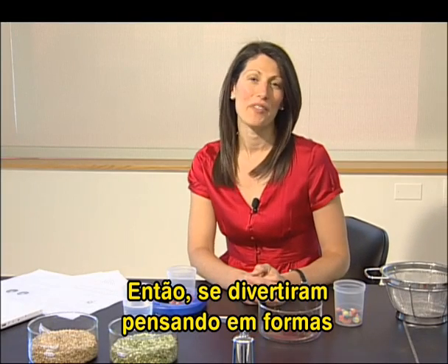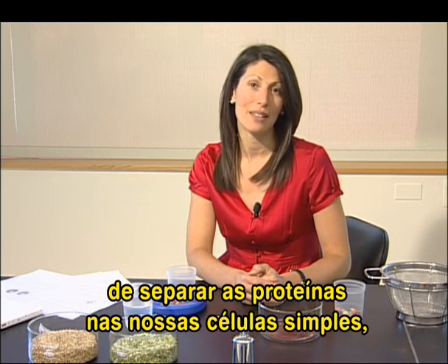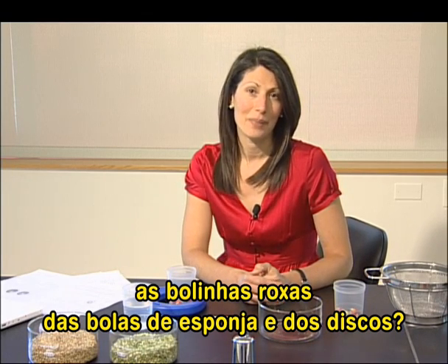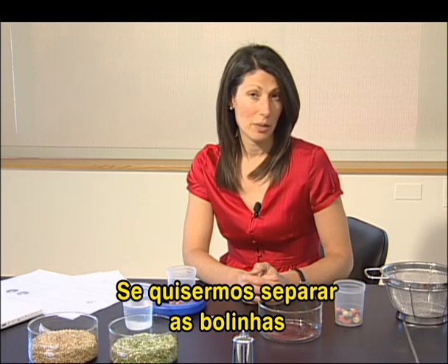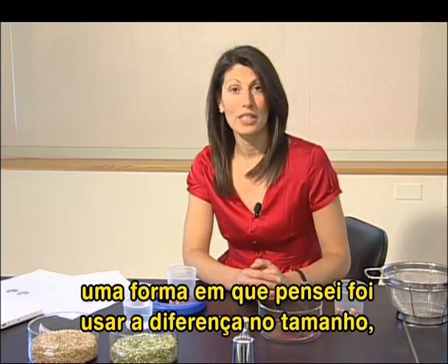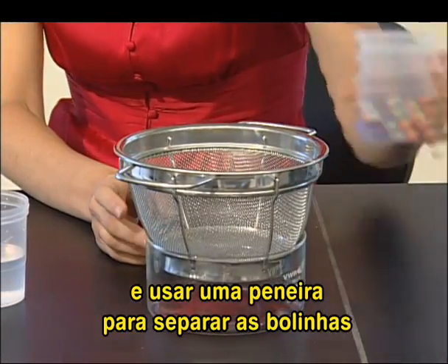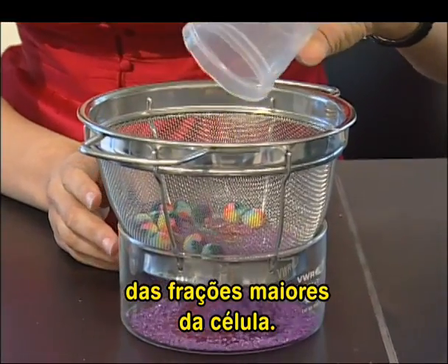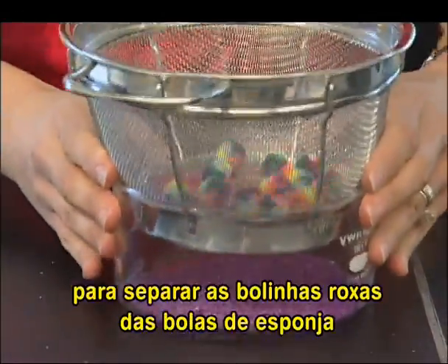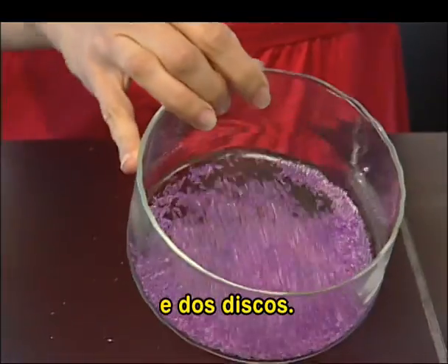Welcome back. I hope you've had some fun thinking of ways that you might separate the proteins that are in our very simple cell, the purple small dots from the puffballs from the flat discs. So if we want to separate the very small dots from the puffballs and the flat discs, one way that I thought of was to use the difference in size and use a sieve to separate the small dots from the larger fractions within the cell. And if we do that, it works reasonably successfully to separate the small purple dots from the puffballs and discs.